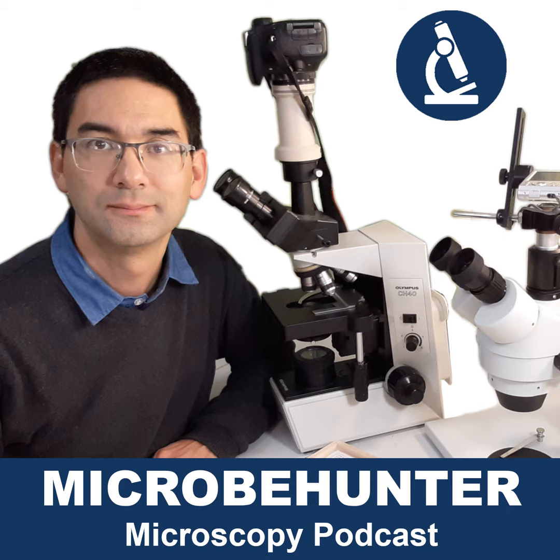However, if you want to look at objects that are larger and opaque, so that means they're not transparent and do not allow light to go through, then you're not going to be happy with a compound microscope. You need a stereo microscope. Let me give you an example. I've got this paper clip on my table right now.